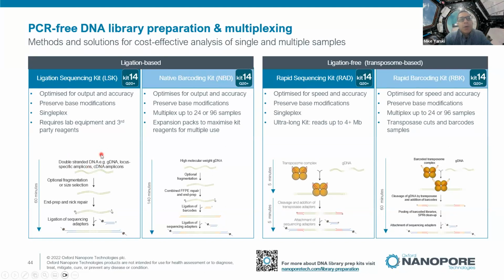Like I know that Omega Biotech does really well with marine organisms, because the Omega Biotech mollusk kit is pretty good for non-model organisms because there's a polysaccharide removal step in there. And so you've got to tweak the extraction to match the organism you're working with. There's an optional fragmentation depending on what your aim is, and I'll talk more about fragmentation. And then it's just simply an end repair and then a ligation of the adapters.